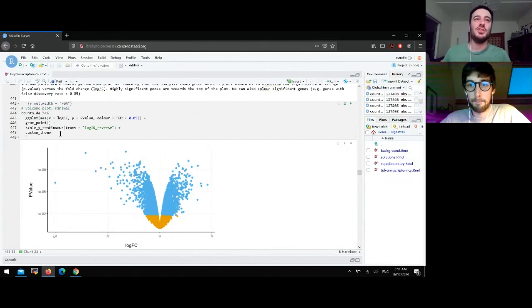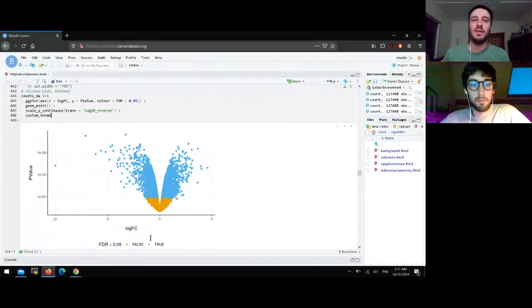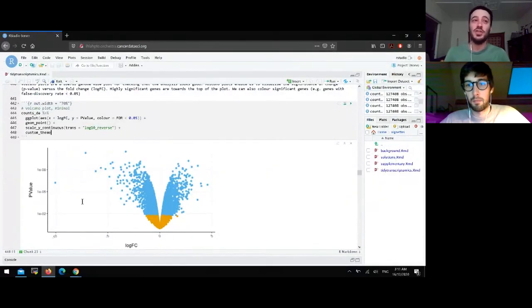So, for example, using ggplot is quite easy here for a base visualization. We can see here that we are comparing log-fold change with p-value. A quite neat thing of ggplot is that it has a quite powerful scaling functionality. And so again, instead of transforming data, for example, calculating the minus log p-value, we can use the raw, the real data, the real p-value, just applying the correct scale. So communicating more transparent information to the user.